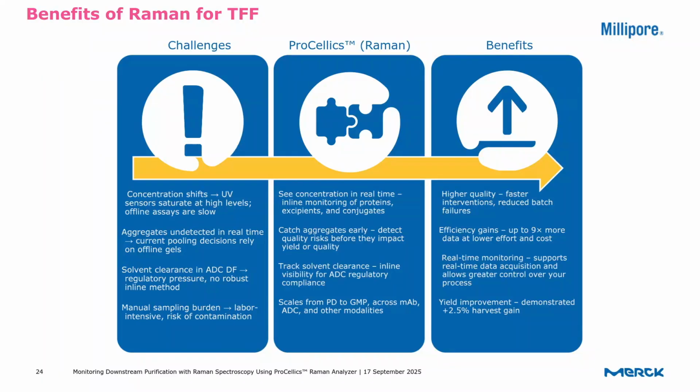And then, as always, what we see with a lot of these steps, there can be a manual sampling burden, especially as you get closer to your final drug product. The risk of contamination becomes greater, and there's increased regulatory burden around any contamination.